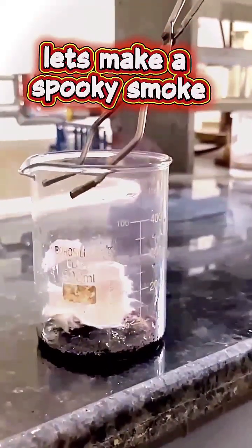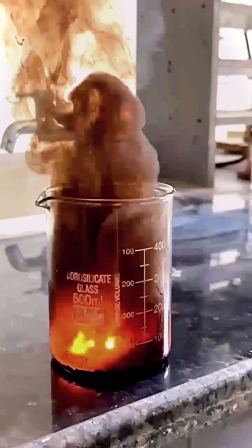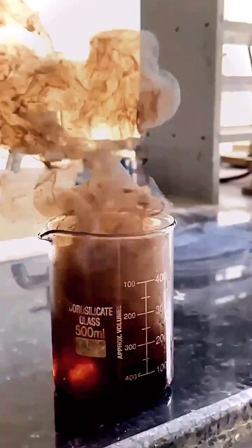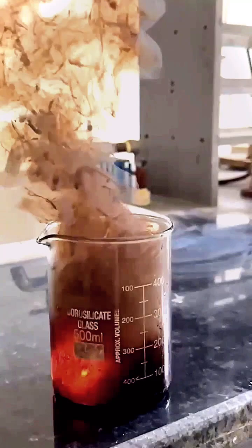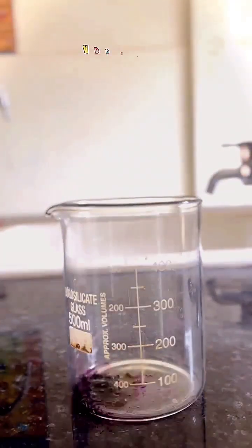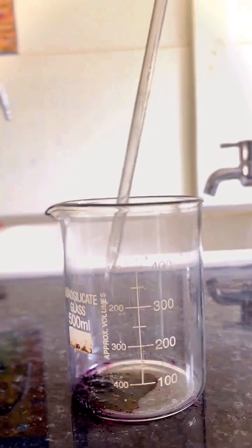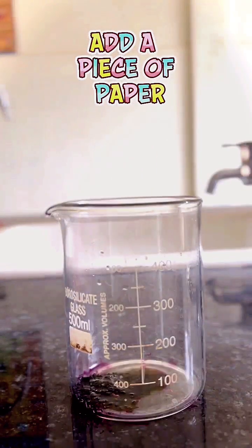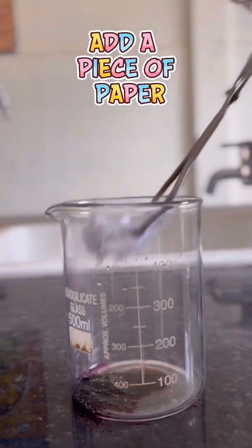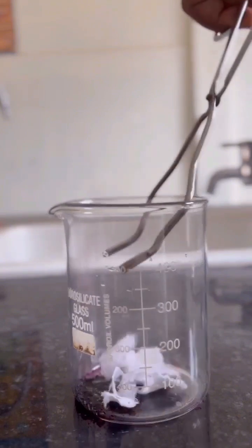Let's make a spooky smoke. Now add a bit of potassium permanganate and a bit of concentrated sulfuric acid. After that, add a few pieces of paper in it. Ready for the final magic.